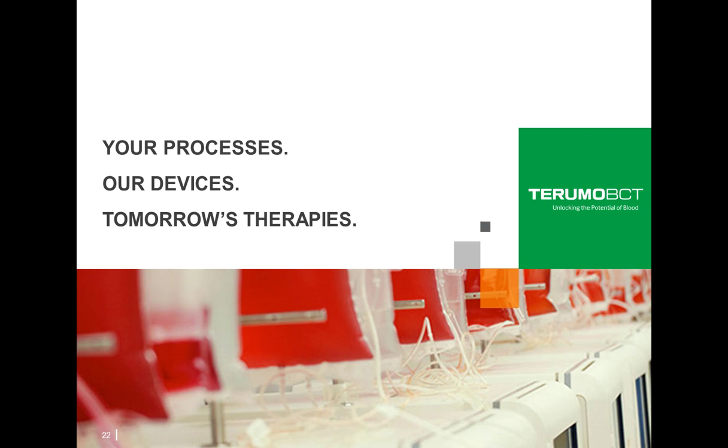And the next one is, any reference to use this quantum system in cell therapy commercial production? For commercial production, I wouldn't be able to comment. I'm not very sure about that, but I can say that there have been more than 11 IND submissions that utilize the quantum as part of their processes, which have been approved throughout the US and EMEA in Europe. There have been at least 3 different clinical trials that are currently ongoing or completed with cells that were produced on the quantum.